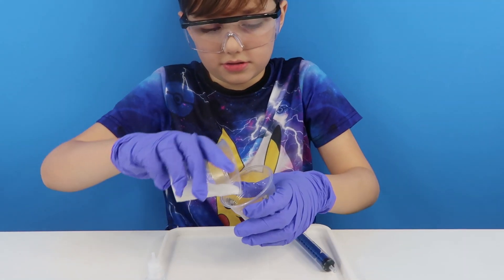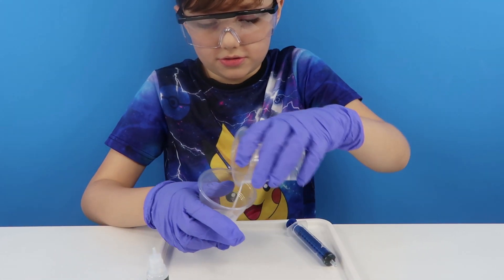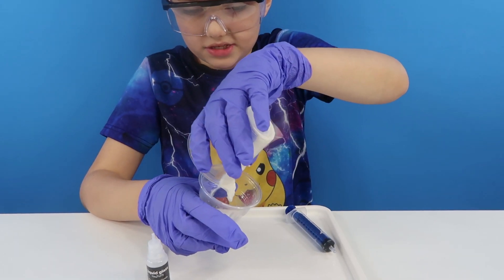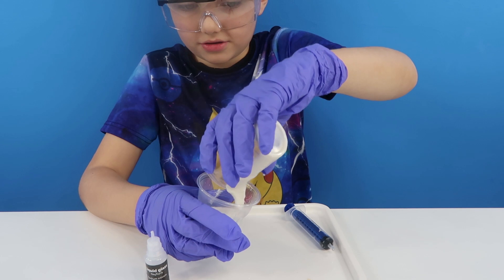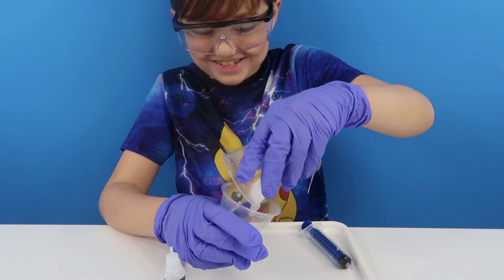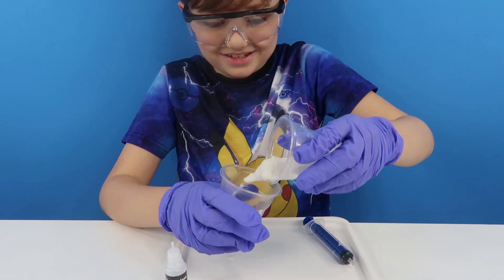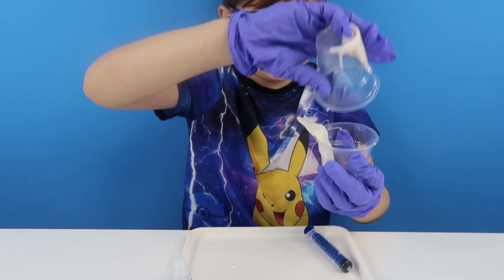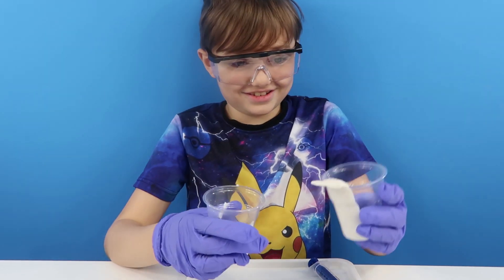And then pour it back. And then pour it back. And then pour it back. Oh, it's all turned like — keep pouring. I can't — just like on that one. Keep pouring Oscar. Pour the other one back. What happened?